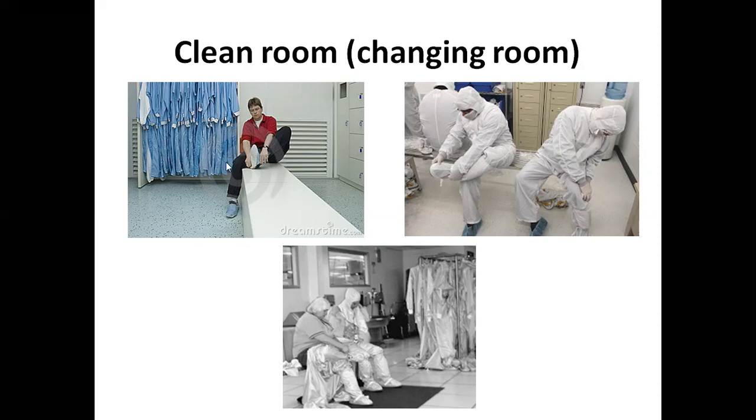So here you see that first, as you enter, this is the bench on which you have to sit. This is the clean side, this is the changing room. So normally through this bench, we divide the changing room into two portions. This is the clean side and this is the dirty side.